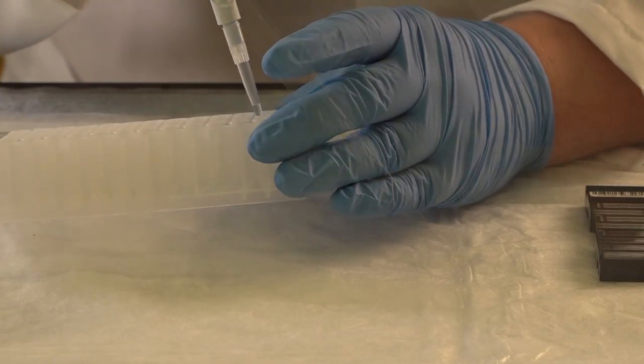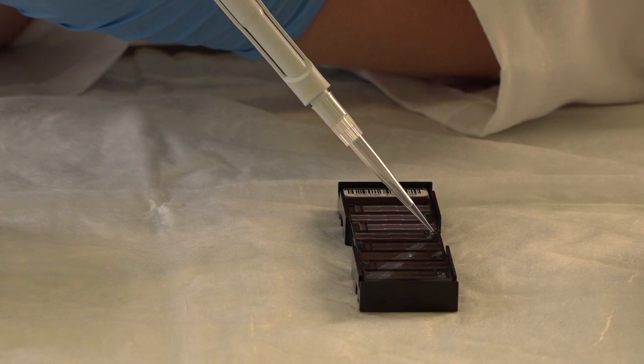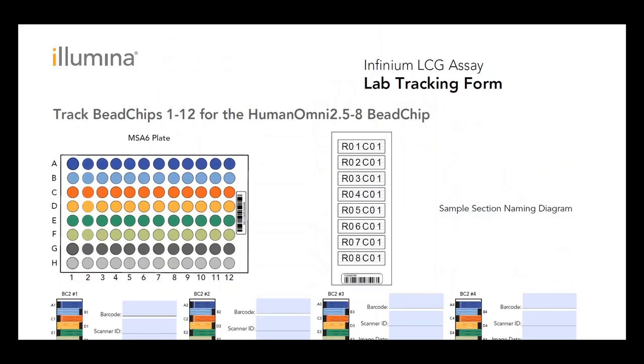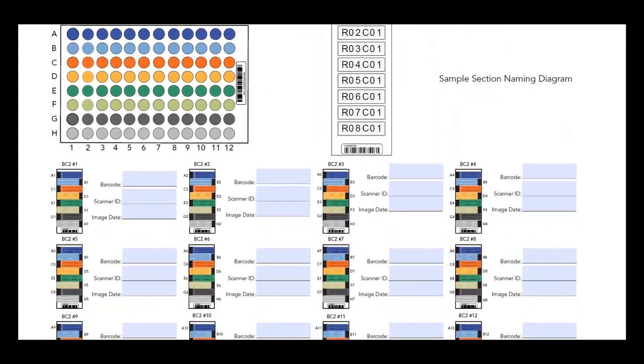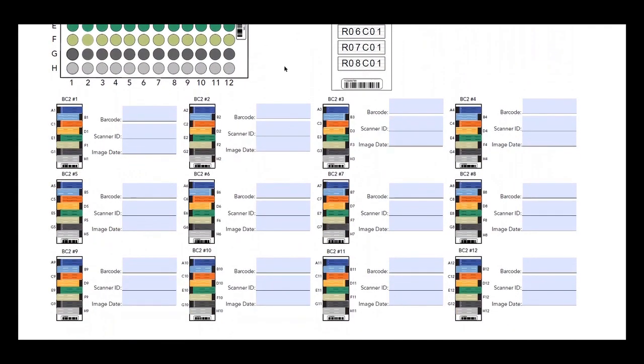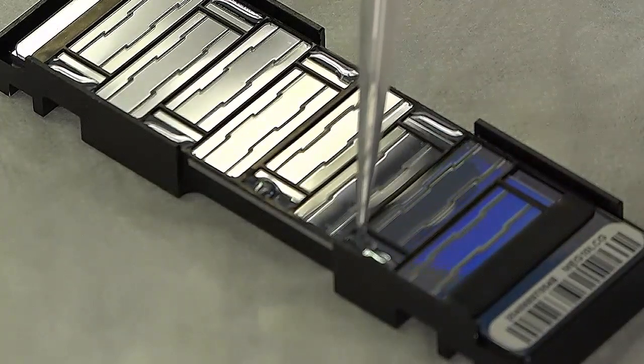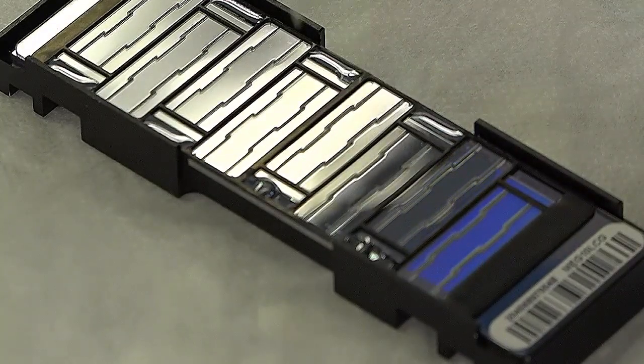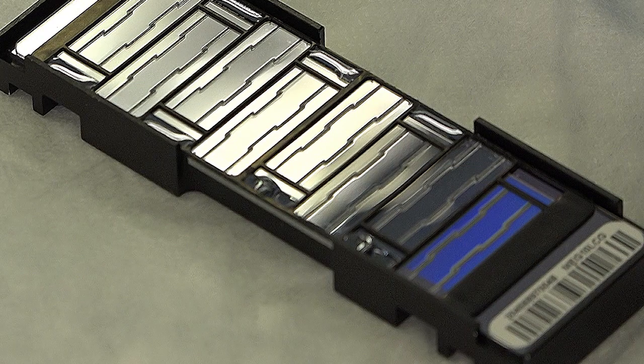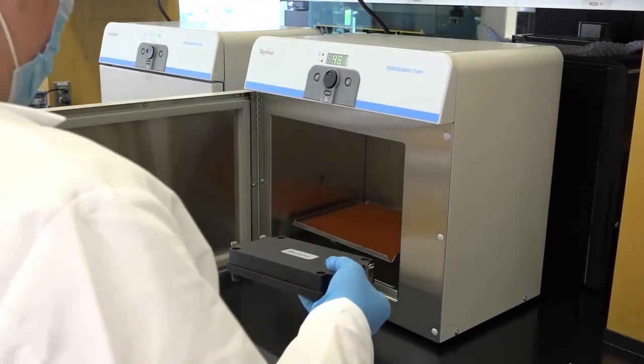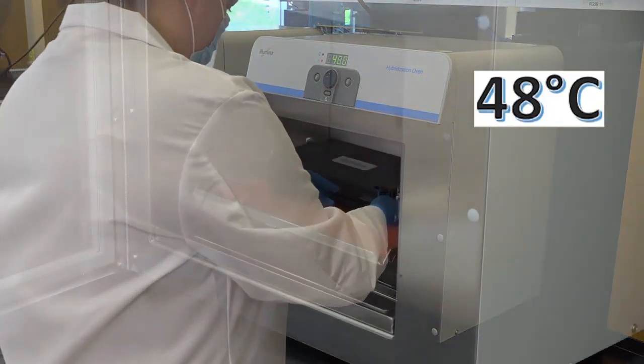To manually load a bead chip, pipette the sample from one well of the amplification plate onto the opening in the seal. Be sure to record the barcode number and bead chip section for each sample applied to a bead chip. Be sure that the sample wicks across the section completely. Wicking may occur slower than shown here. Once all samples have been loaded, place the bead chips into the Illumina hybridization chamber. The hybridization chamber should be at room temperature. Hybridization takes place overnight at 48 degrees Celsius.